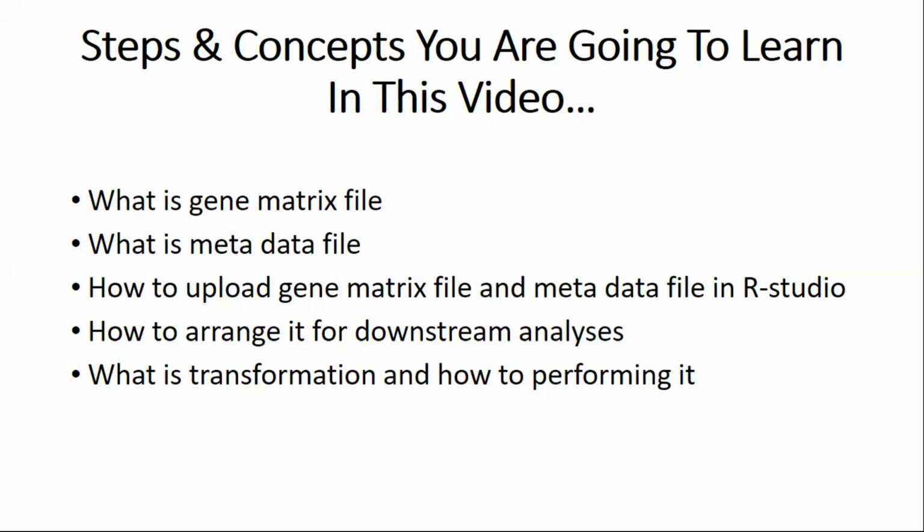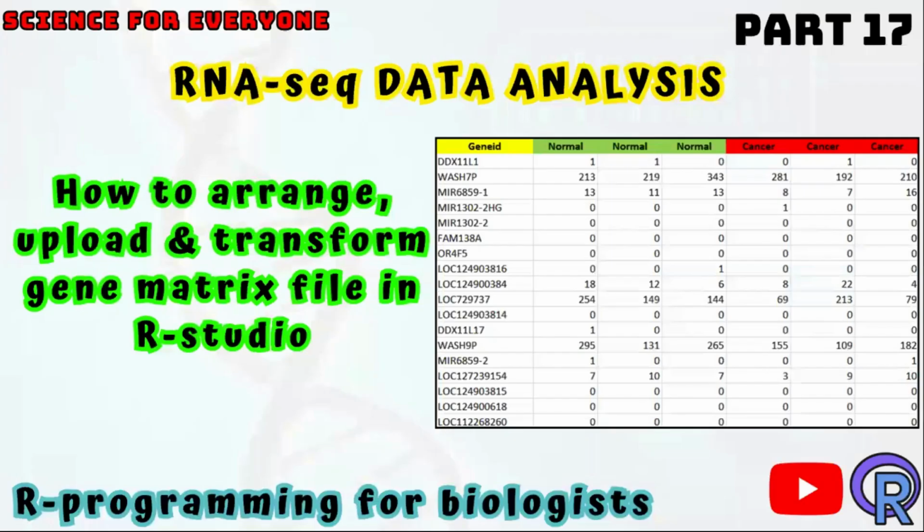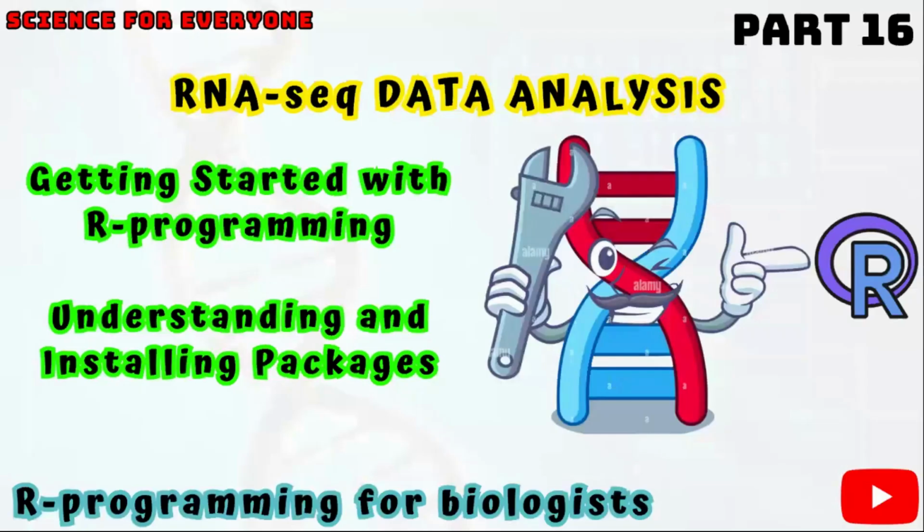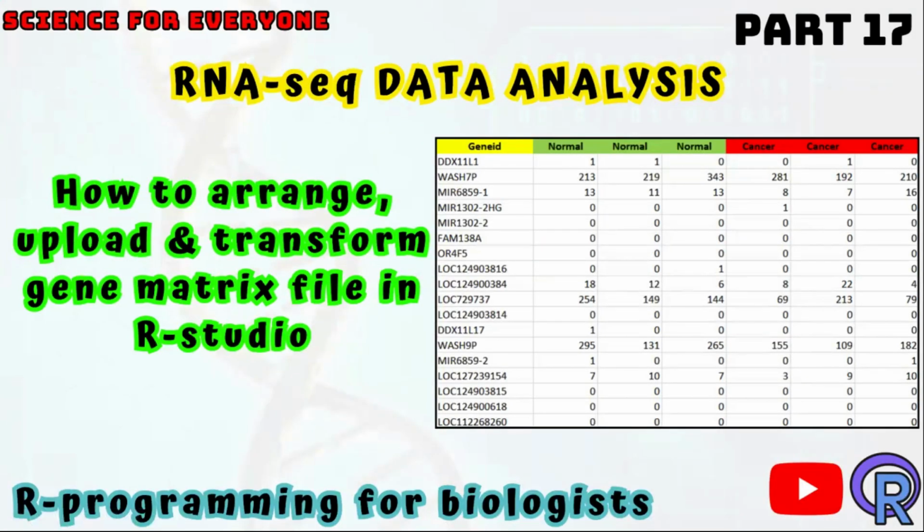So I think you have got your concepts. I already provided the code in the video, just copy it from there or type it from there and perform it on your computer also. All you need is a gene matrix file and a metadata file, and these were all generated from the alignment and quantification analysis. If you haven't started this video series, start watching this RNA sequencing data analysis from the very start, so that you know how this matrix file is generated, what this matrix file is, and what the gene counts are.